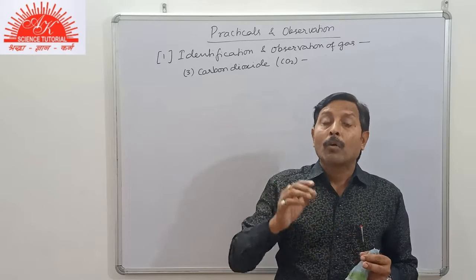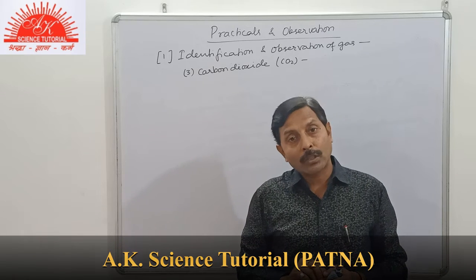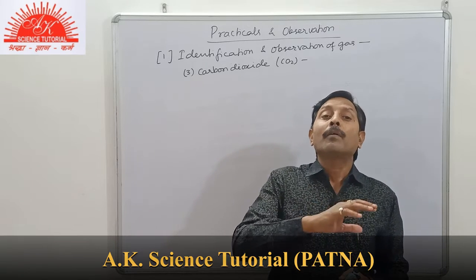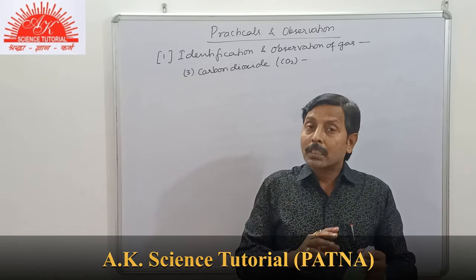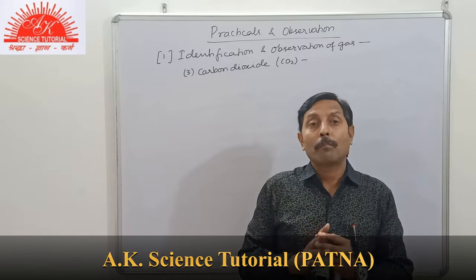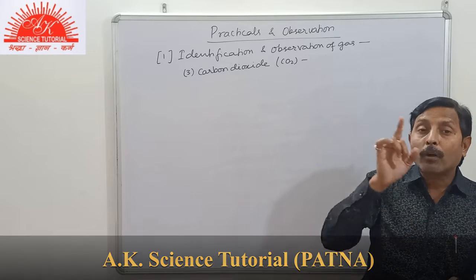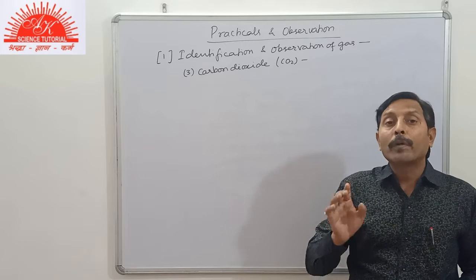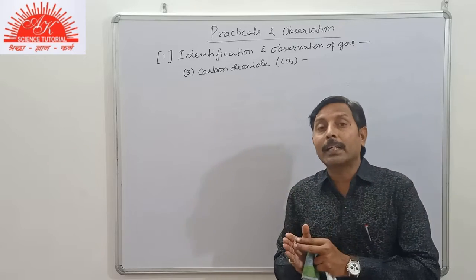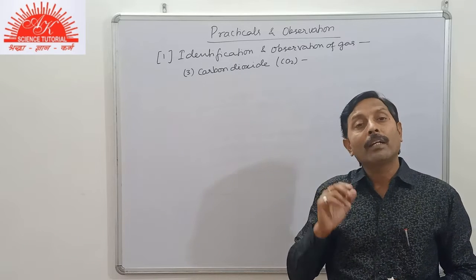As well, when excess of this gas is passed through that solution, the milkiness disappears. This is a test for CO2. But this test is also given by sulfur dioxide, so we must use another test to distinguish it from sulfur dioxide.